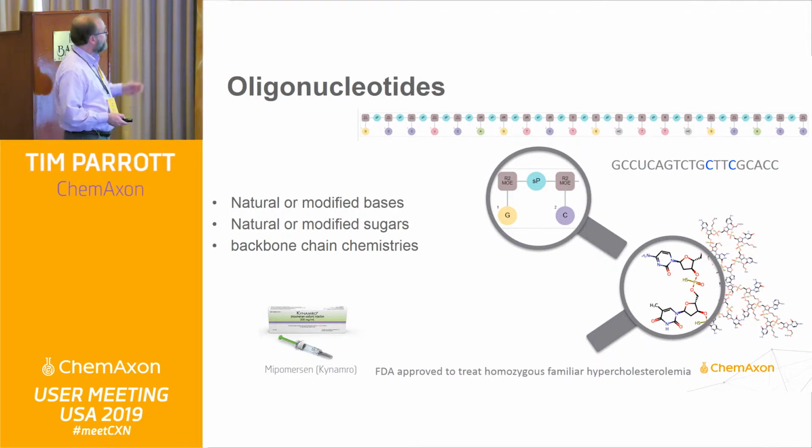And so we have the ability to put these in here too, and represent a variety of different types of oligonucleotides and antisense chemistries.